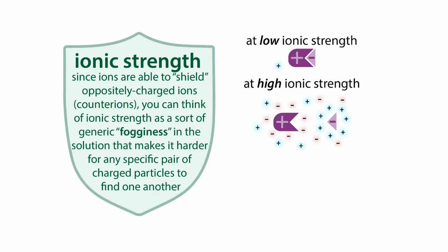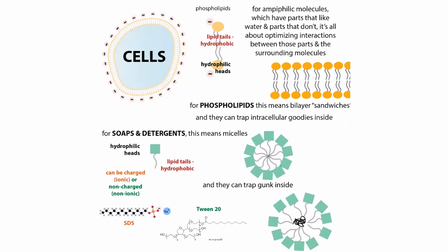You can also increase the amount of detergent. So detergent basically is an artificial soap, and it's going to be able to kind of break up interactions. Often what we're doing with these experiments is using some sort of non-ionic detergent. So something that's not charged is going to be gentler. It's not going to disrupt the protein interactions as much.